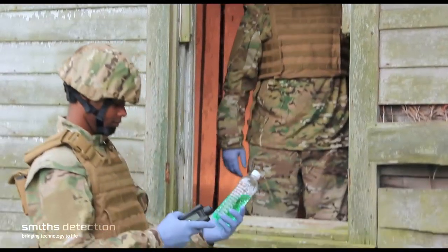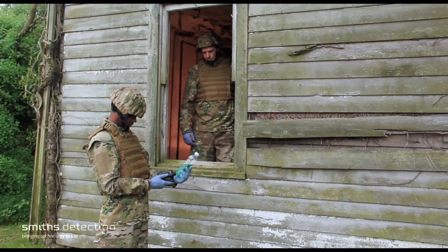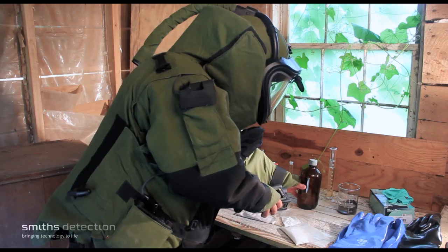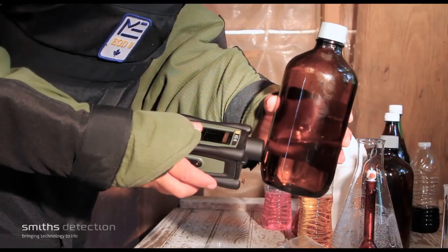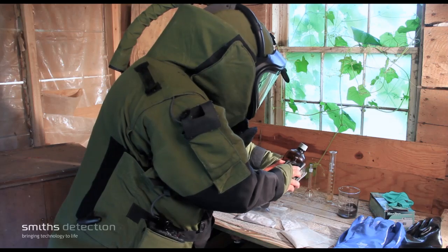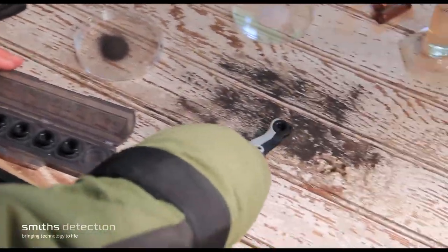ACE-ID is ruggedized for use in severe climates and terrains. It is lightweight and can be operated with just one hand. ACE-ID utilizes an advanced optical platform to minimize heating dark samples during analysis, and provides operation using a rechargeable lithium battery with automated data output.